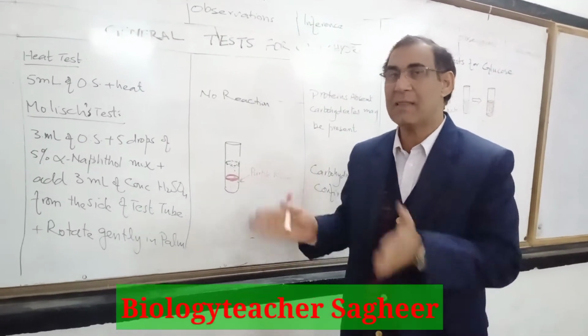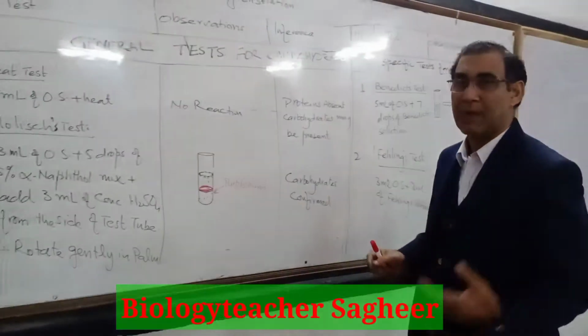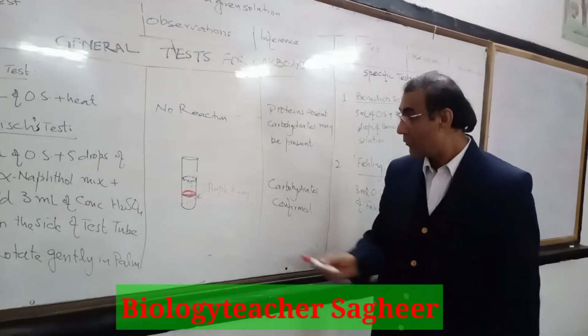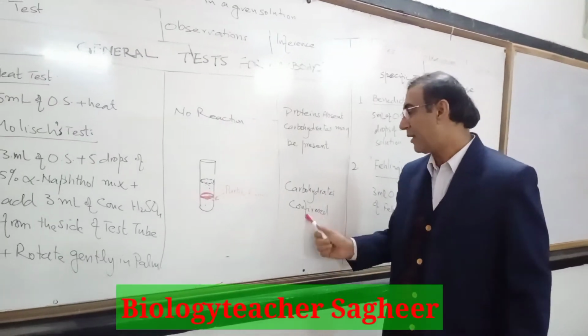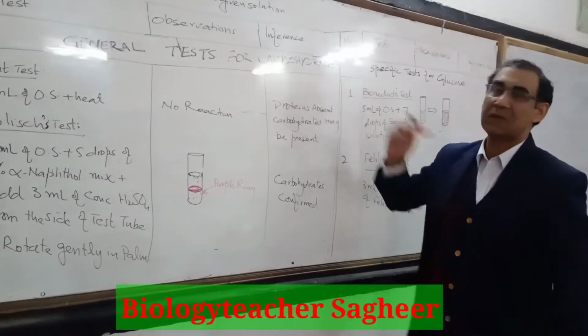Okay, you can see that purple ring in certain videos in my lectures, in this study channel. If this ring is formed, then carbohydrates are present in that very solution. These are the general tests.